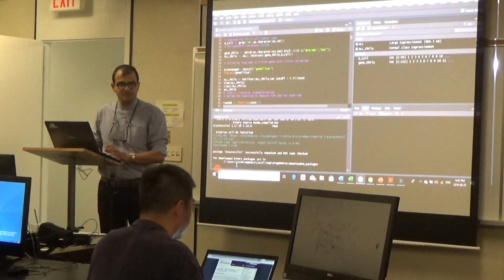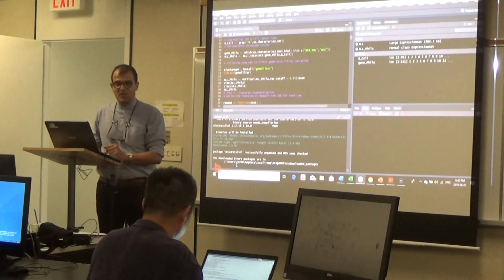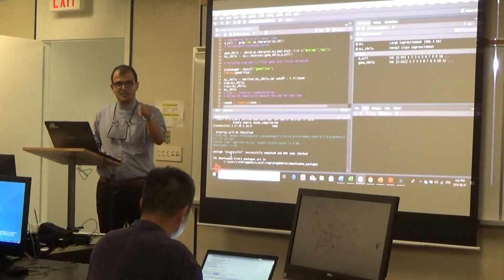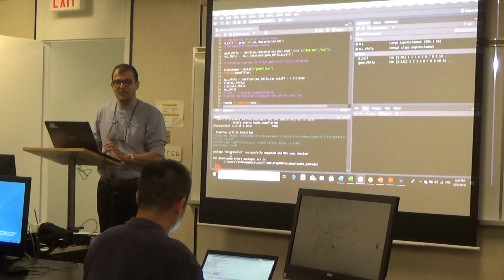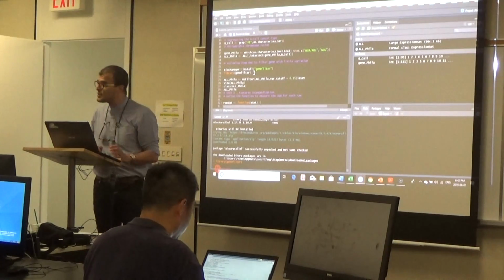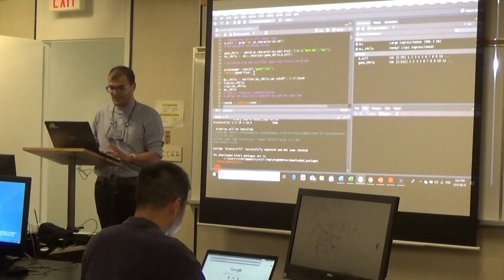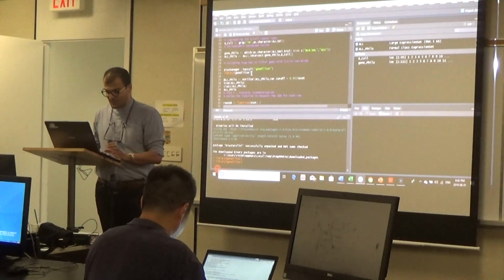There's something like on the Windows system set HGU and a weird name. Yeah, you have to install that package also. This is going to be for human genome data sets. Copy paste that, it comes with .db, huh? Yeah, .db. Yeah, please copy paste the whole thing. Just go to Google, find the BiocManager command to install it. Normally the workshops for cancer genomics require, I should say, at least a couple of days, but we are just going to have a kind of a taster for just 2 hours.